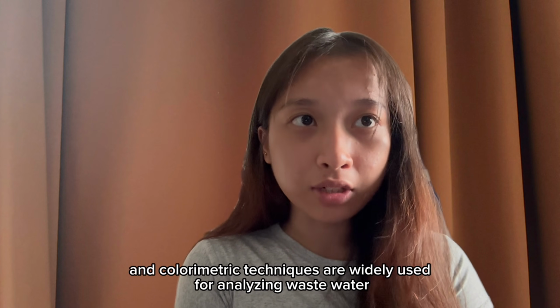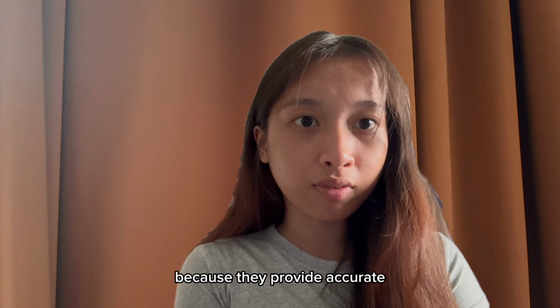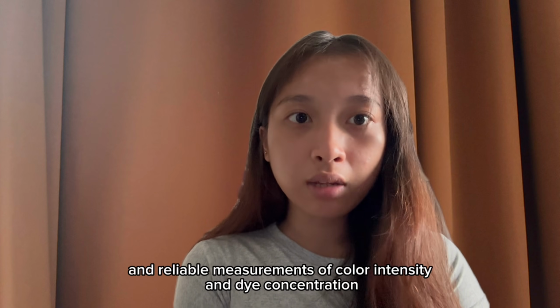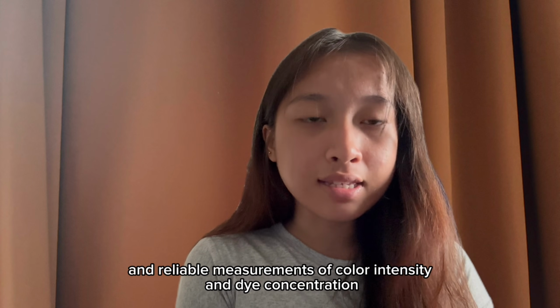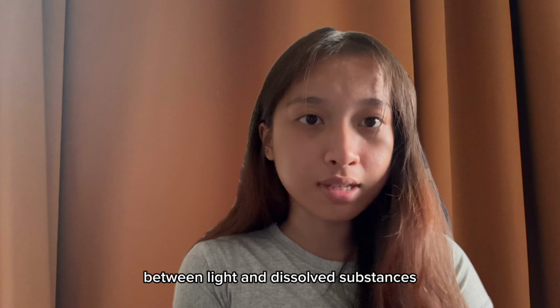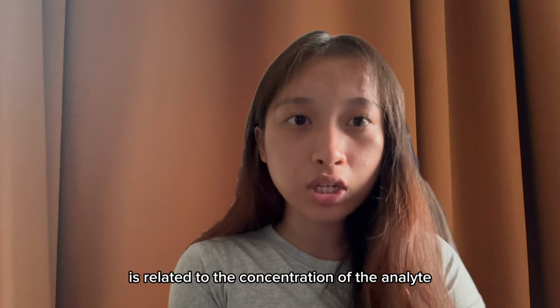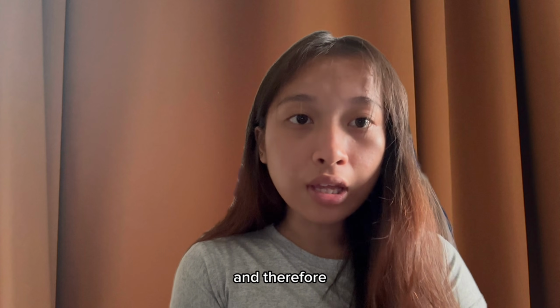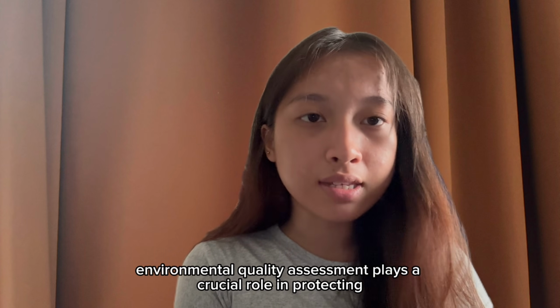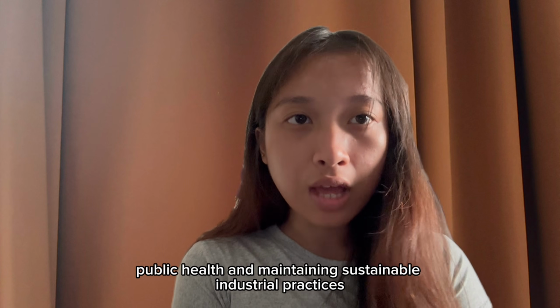Spectrophotometric and colorimetric techniques are widely used for analyzing wastewater because they provide accurate, rapid, and reliable measurements of color intensity and dye concentration. These methods are based on the interaction between light and dissolved substances, where the amount of light absorbed is related to the concentration of the analyte. And therefore, environmental quality assessment plays a crucial role in protecting public health and maintaining sustainable industrial practices.